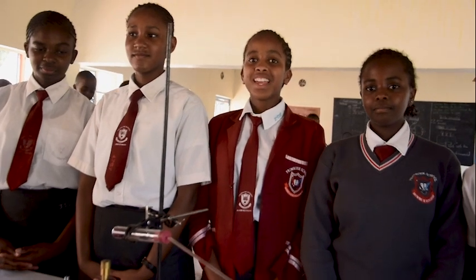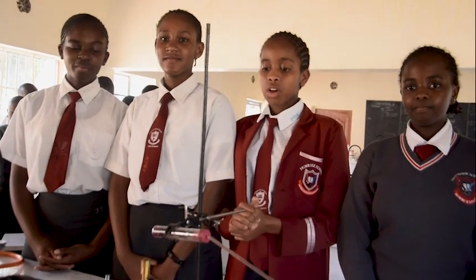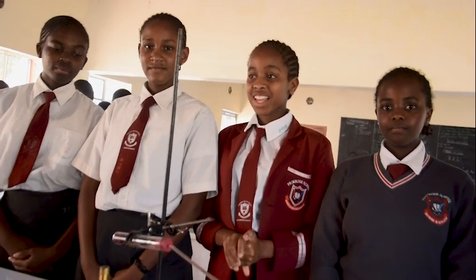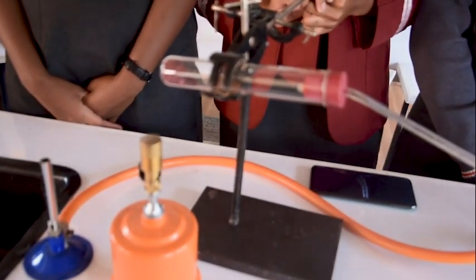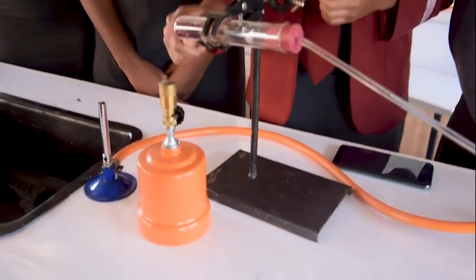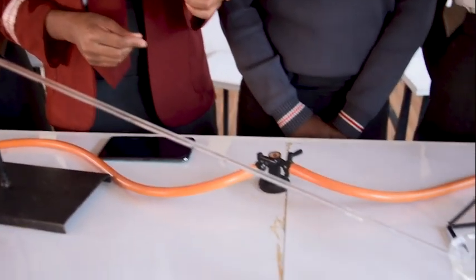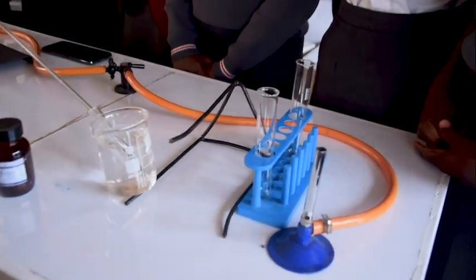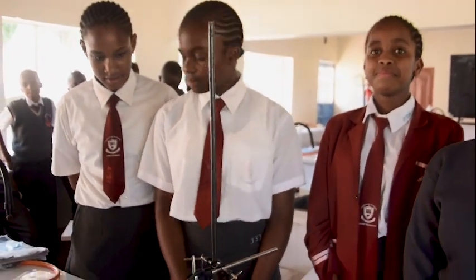In front of you are grade 8 learners from Bika Frumbos. We are conducting an experiment on the effects of heat on substances, and in our case, we have hydrated cobalt 2 chloride, which undergoes temporary chemical change. The apparatus are: boiling tube, portable burner, the retort stand, the delivery tube, and then over there we have the beaker and the ice cold water. So let us take a look as we make an observation on the experiment.